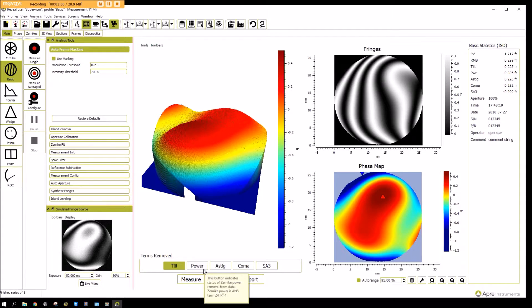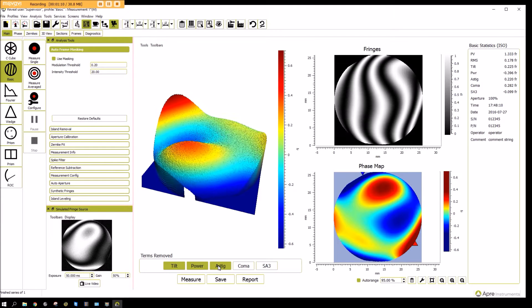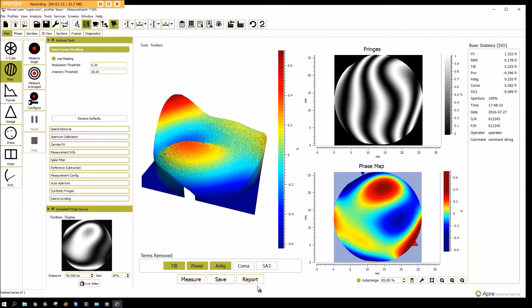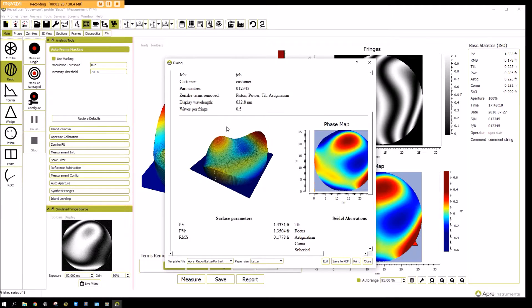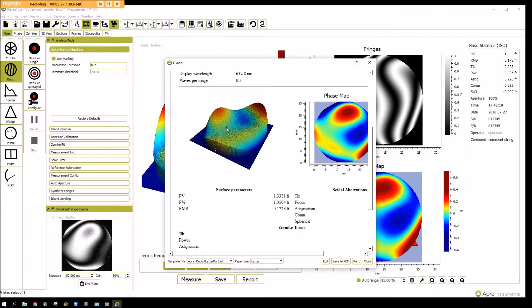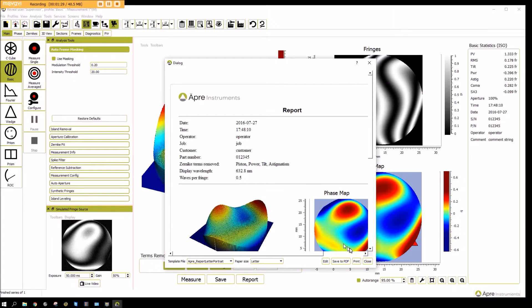Terms can be removed, like power or astigmatism, very quickly from the display. And then if you need a report, by clicking on the report button a fully modifiable report can be brought up, as shown here. It can then be printed or saved to a PDF.